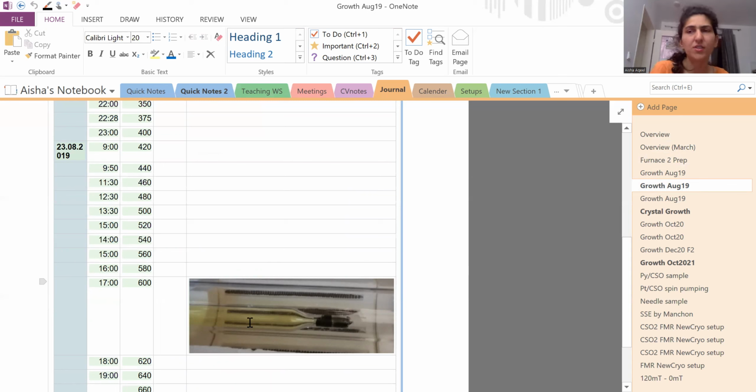In an Excel sheet you can also put pictures, but for details and more pictures and more information, I use OneNote more than the Excel sheet. And for things where I want to know a parameter very quickly, I use the Google Excel sheet, which I can access anywhere.